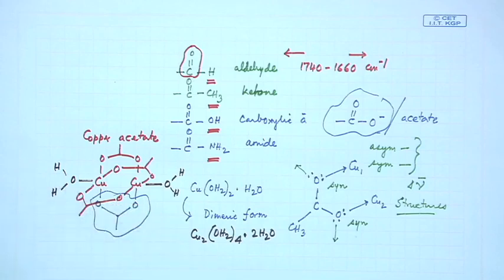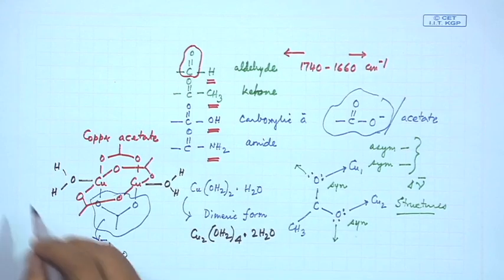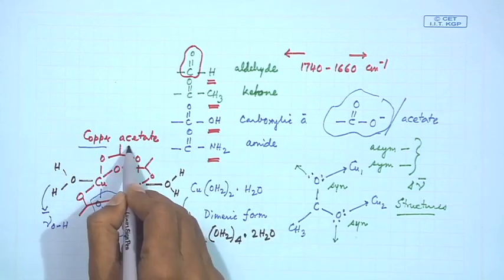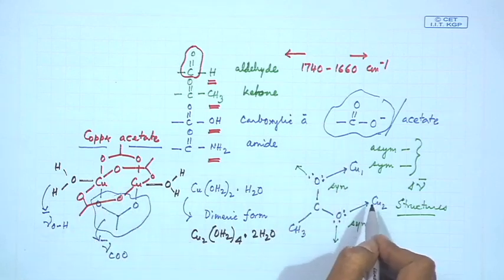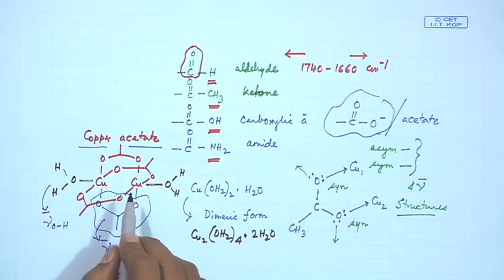because the presence of these water molecules also gives rise to the corresponding characteristic stretching frequency, as this will be for COO. Similarly, we get this for your nu bar OH function. So, all these things. If we think that this is a particular structure of copper acetate, we get the characteristic stretching frequencies for this, which also identify that you have a syn type of binding for this typical copper salt.